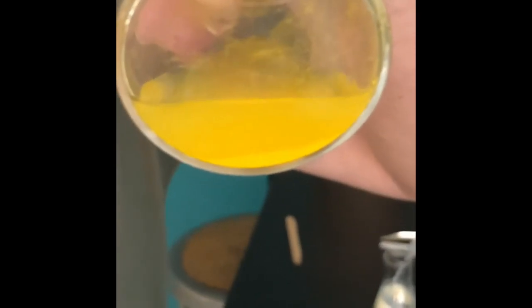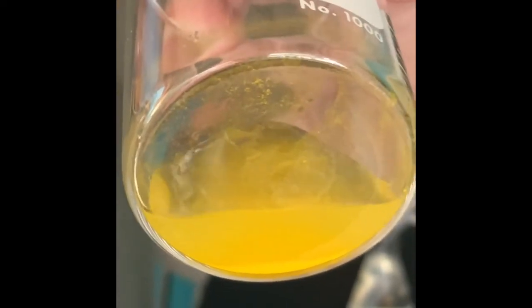All right, guys, this is the precipitate forming. If you look carefully at the bottom of that beaker, you can see that it is a solid. A precipitate is a solid formed when 2 water-based solutions react together. So even though that looked like it was a liquid, it is a solid. The liquid is yellow because the particles are so tiny and still floating there. Given enough time, it will all settle to the bottom.